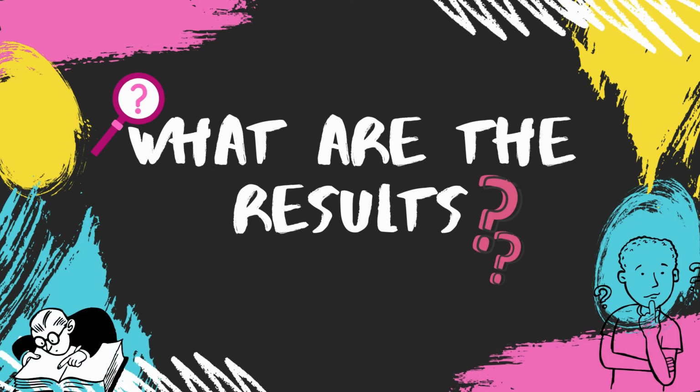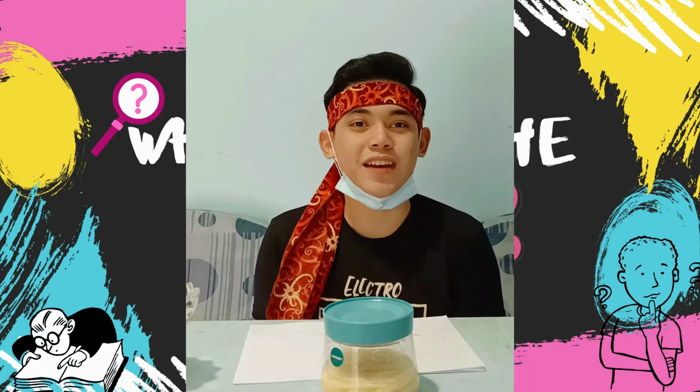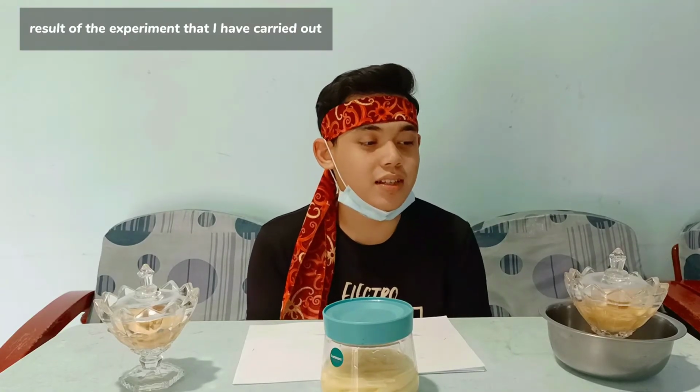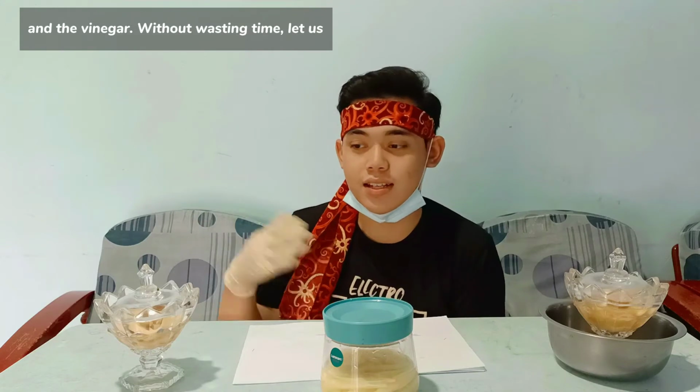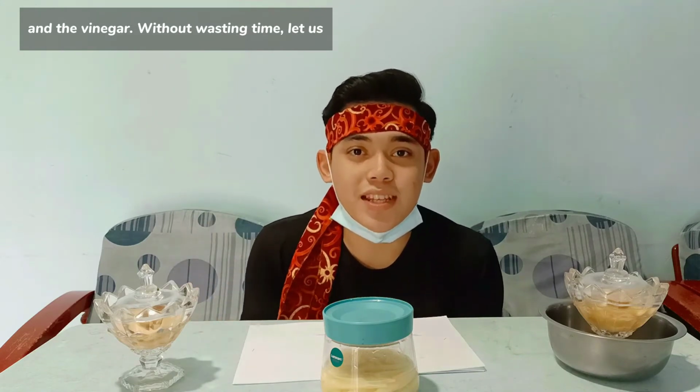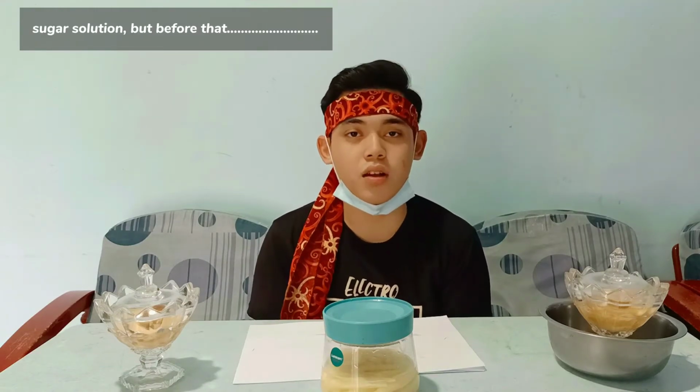One week later. So hello everyone, today I will be sharing the result of the experiment that I carried out 7 days ago. In front of me are the 3 containers containing sugar solution, salt solution and vinegar. Without wasting time, let us take a look at the first container which contained sugar solution.